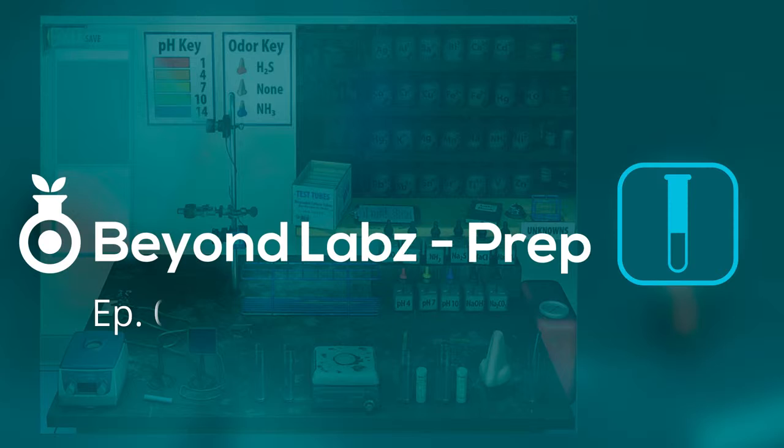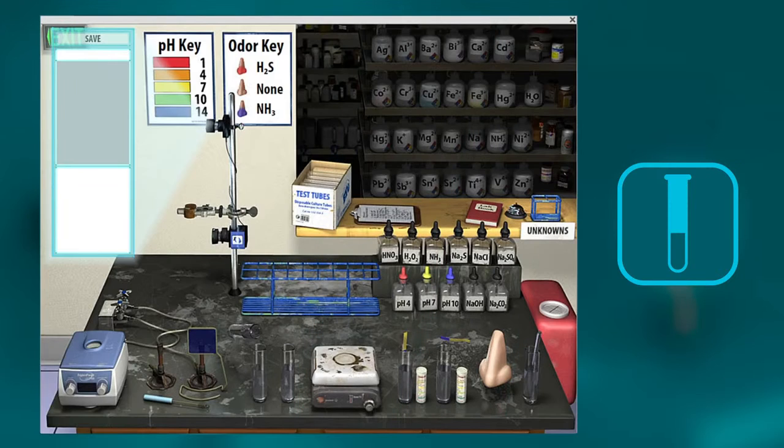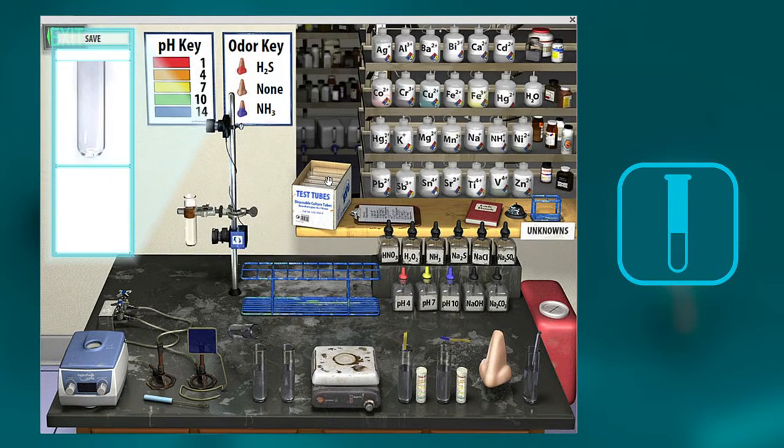Hi, this is Heather. Today we're in the inorganic laboratory and I'm going to show you some qualitative analysis to get you used to how the laboratory works, to prep you for when you need to do this in your actual lab classes. So I'm going to show you with a transition metal separation just so you can see the capability of the labs. So we're going to start by adding cobalt, copper 2, and nickel. These are three that are relatively simple to separate, but you need to know the different steps to get there.